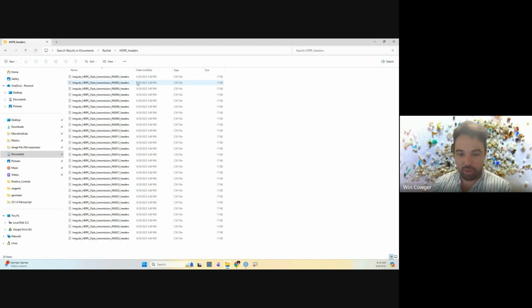Once you see how fast this batch analysis goes, you're going to be like, oh man, I really need to start collecting my spectra like that if you're not already, because it really moves so fast. Single analysis is going to take 5 minutes or something like that. You can do 1,000 in 5 minutes, and if they're all super high quality spectra that have top hits, you just download your data and you're ready to write your paper, versus sitting here in every single spectrum, fine tuning the analysis of it. And I'll show you that.